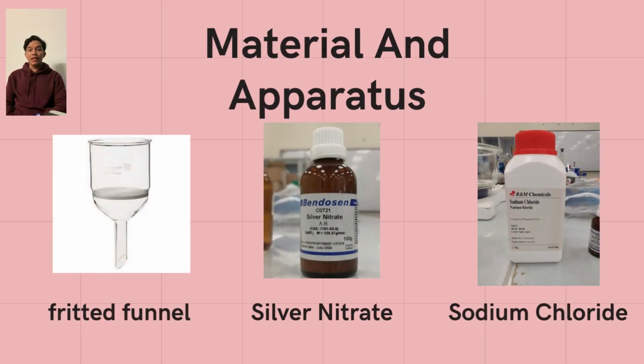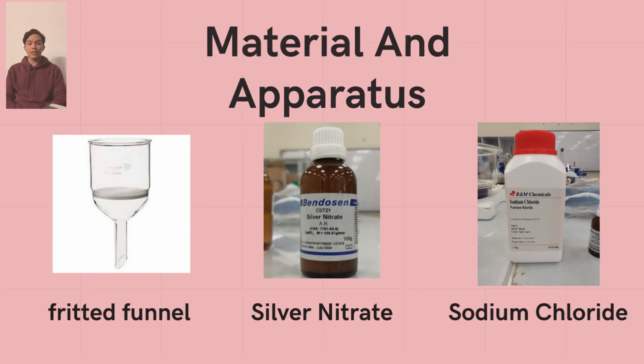Next, the materials and apparatus that have been used for this experiment are 6 molar nitric acid, 0.2 molar silver nitrate, sodium chloride, and a filter funnel.